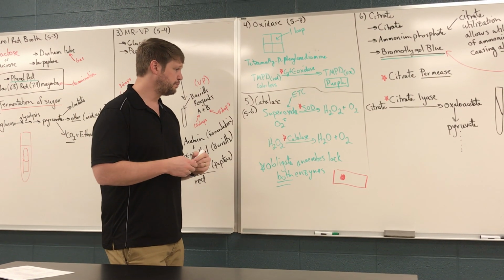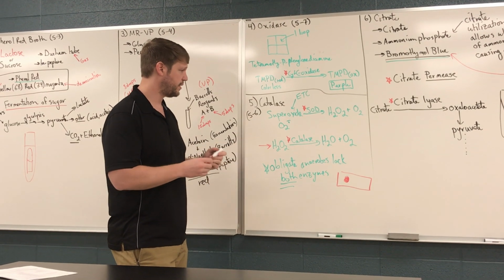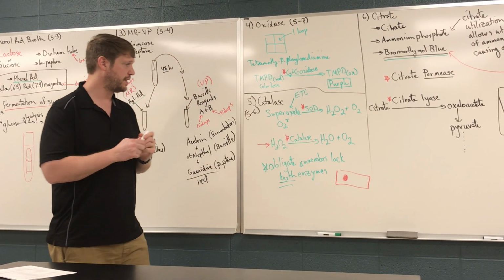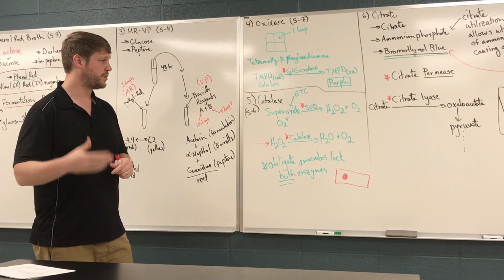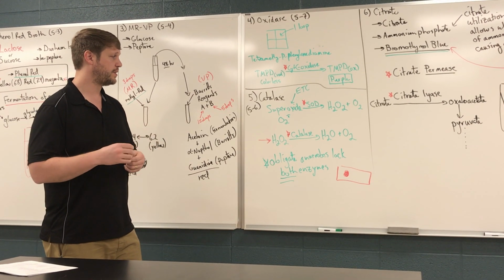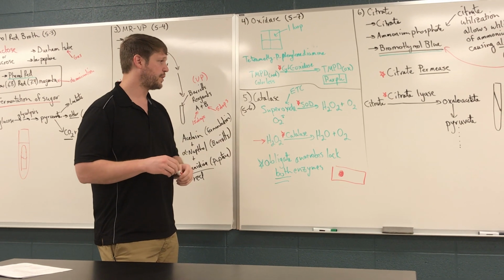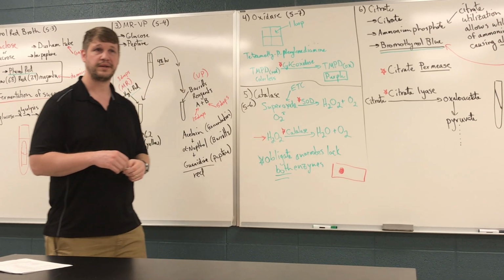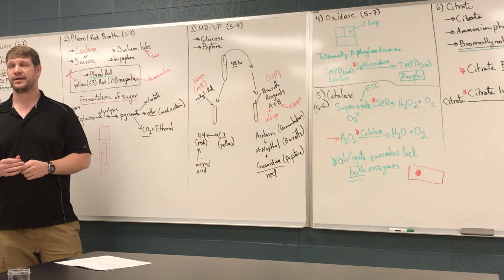The main thing we're really looking at here is this presence of catalase, which is really an adaptive feature of microbes that are utilizing oxygen or utilizing some sort of electron transport chain where superoxide can be generated. Any questions about that?